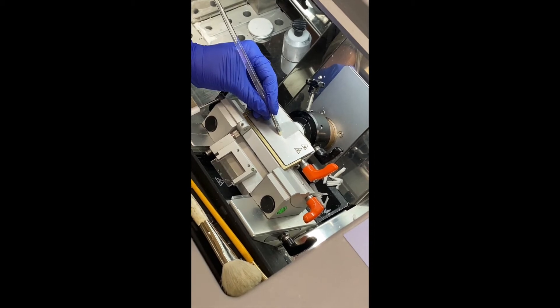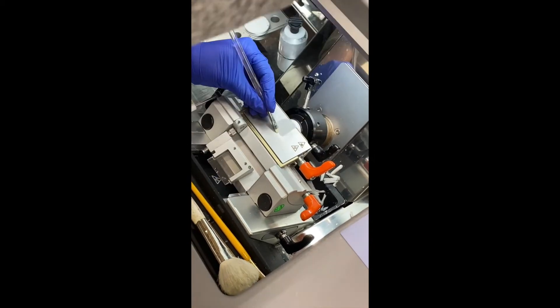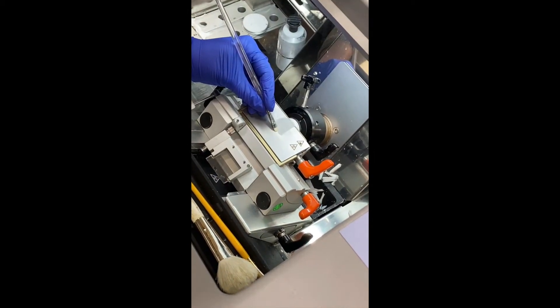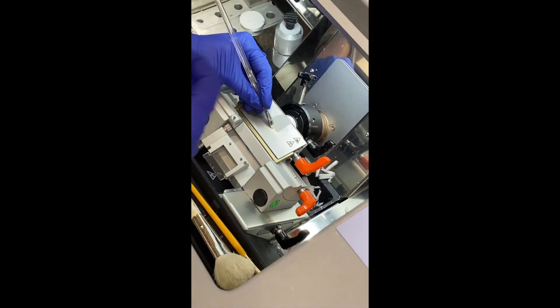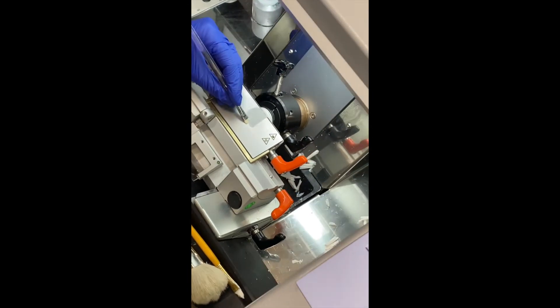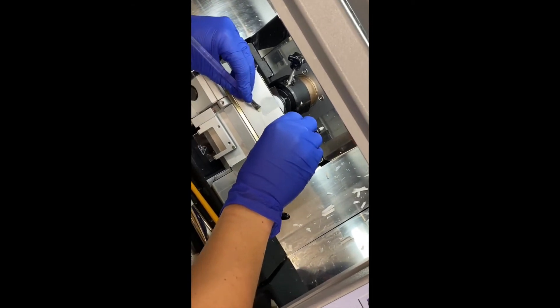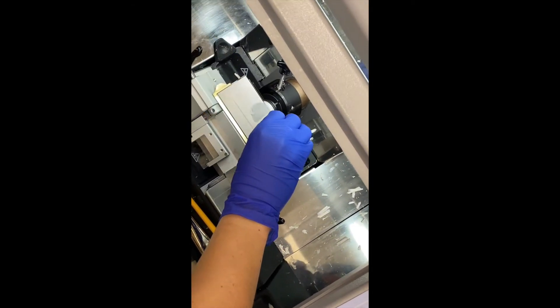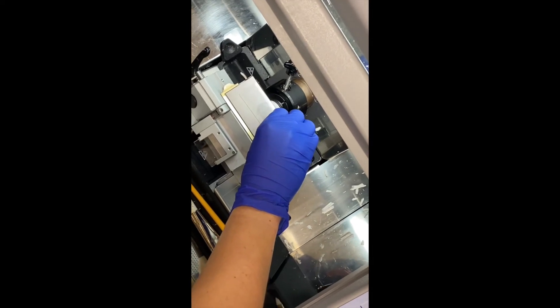When the specimen has been entirely cut, use your brush to stabilize the specimen in place so it doesn't roll back upon itself. Remove your brush, grab your slide, and use your slide to pick up the portion of tissue that was just sectioned.